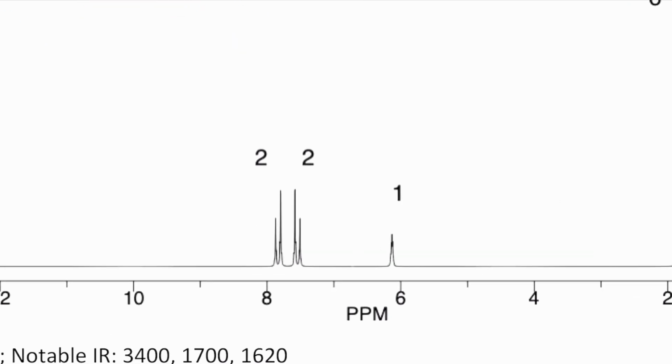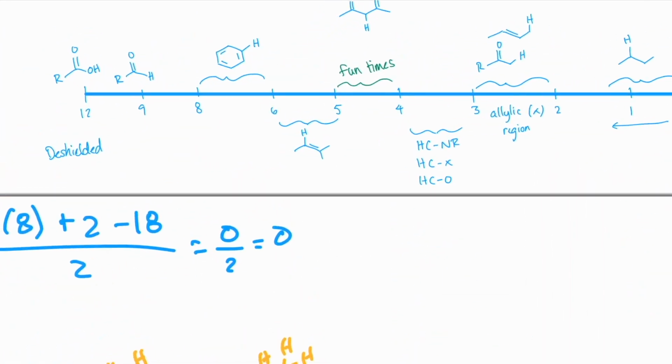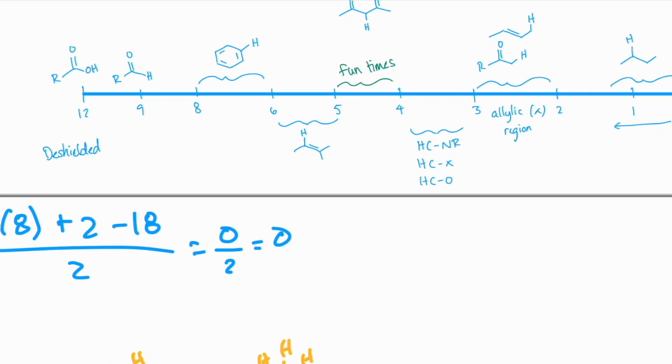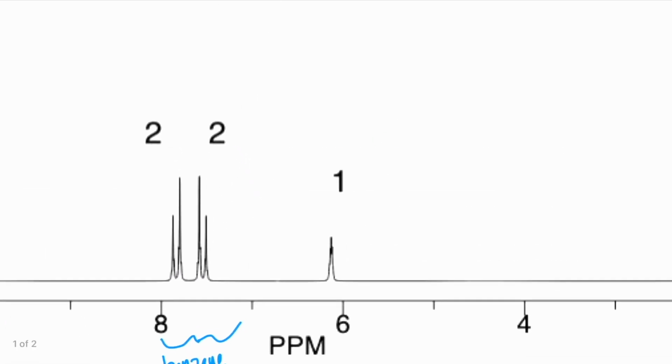But if we see, hey, we have some hydrogens in the benzene area, right? If we reference our chart, this 8-ish area has a benzene, right? And we see that here. So likely we have some benzene H's. And let's logic this out for a second.